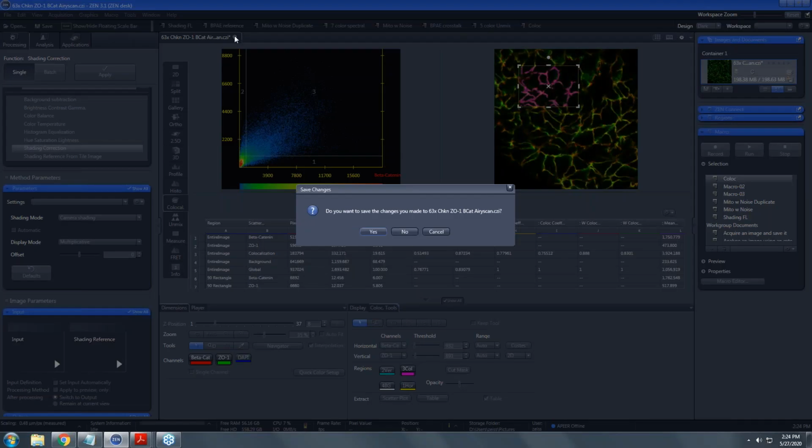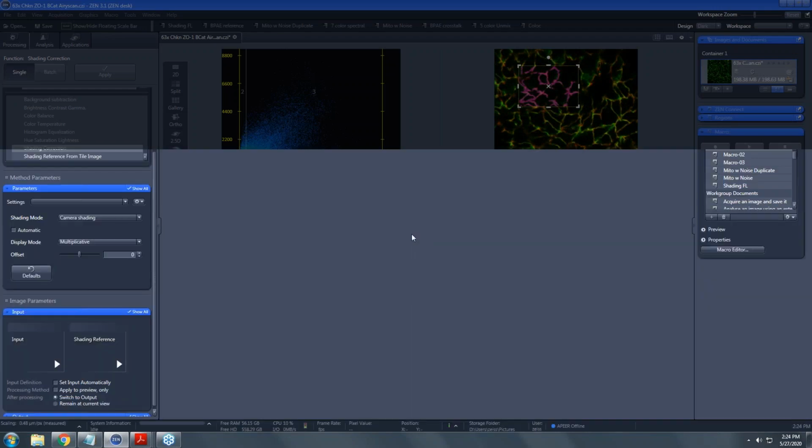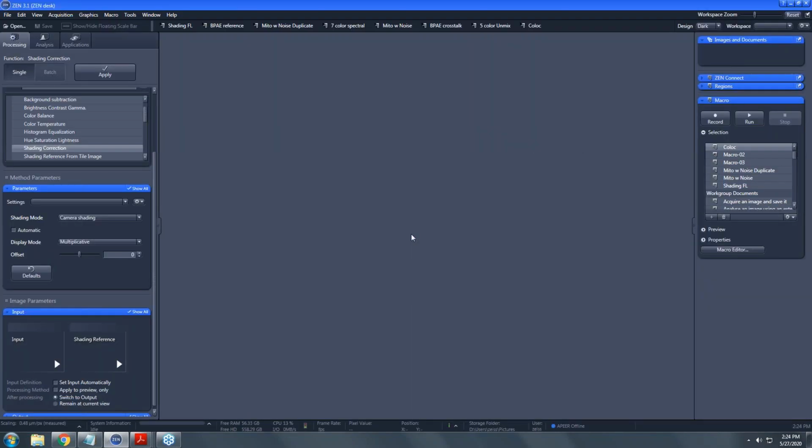So again, I think that this came out of a question that we had last time, although I followed up with the person who asked the question, and I think maybe there was a misunderstanding. But by the time we sorted it all out, we decided that we were going to do colocalization. Colocalization we did.